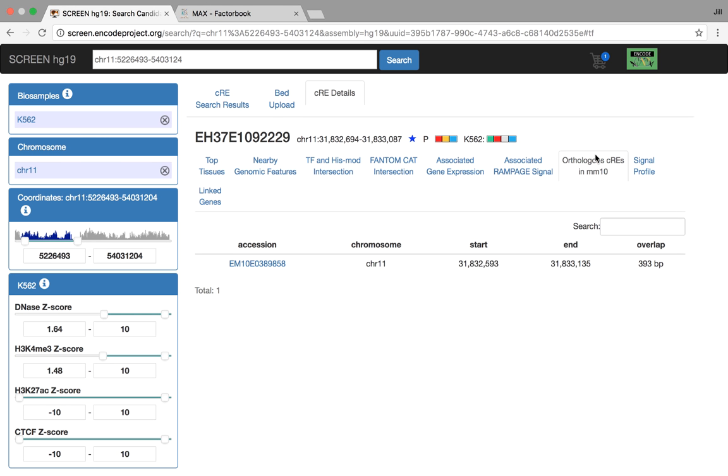Jill was talking about relating mouse and human CREs. Here we do liftover from human to mouse and mouse to human, and we have the lifted over. If the liftover intersects another real CRE in the other species, we actually display that link here. You can click on that and investigate those.